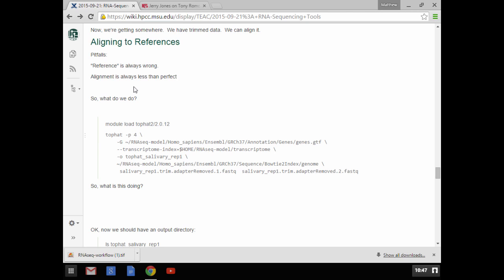What is it actually doing here? It's trying to do alignment. What is it aligning and what is it aligning to? So, read aligners. How many people actually know what a read aligner is and is doing? So read alignment is the process of taking a reference sequence, taking short reads, and getting them to actually display the point at which they should match to the reference genome.